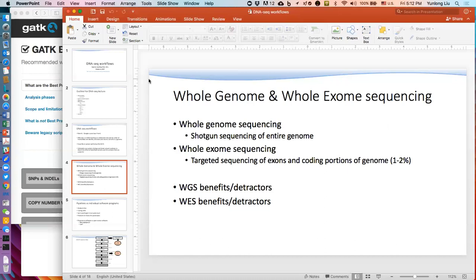The files for whole genome sequencing are going to be much larger. Whole exome is much smaller. It's more specified. But the timing on it, which in a research setting for people that are trying to get out grants and papers and trying to forge into new areas of understanding the human genome and its functions, it's much more specific.